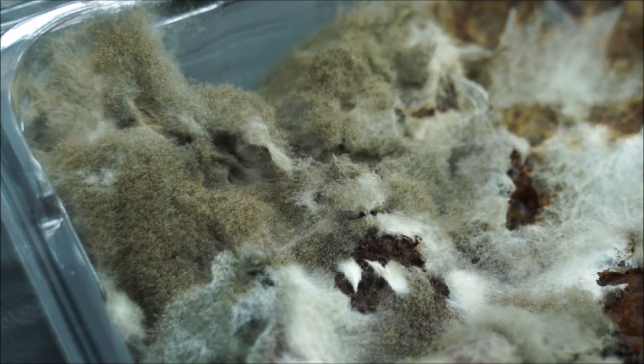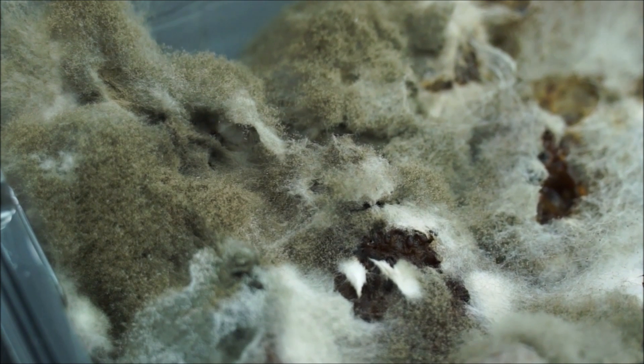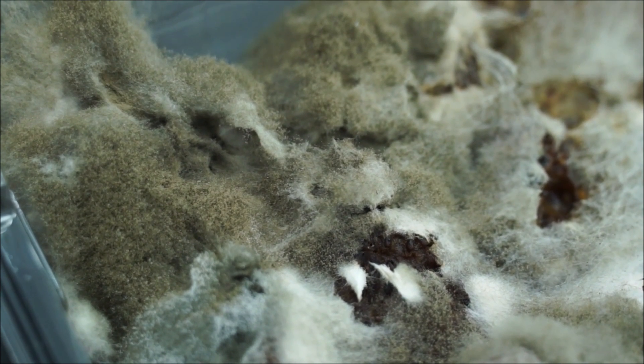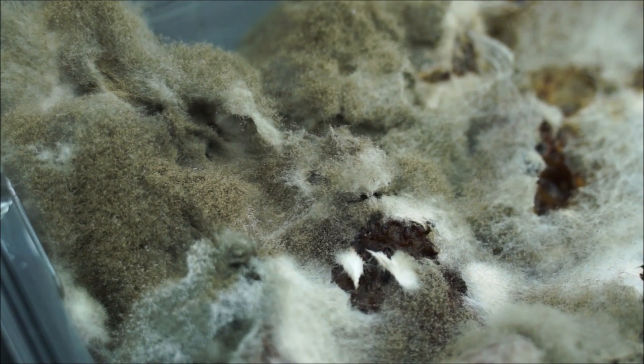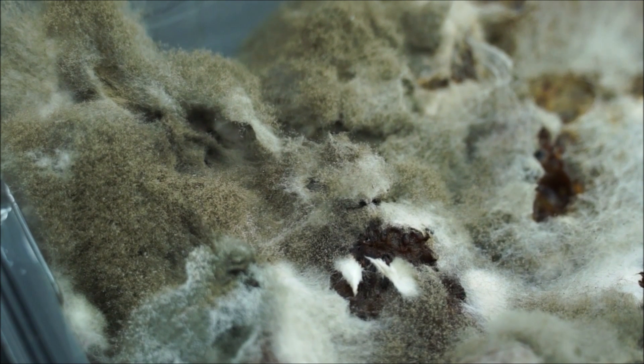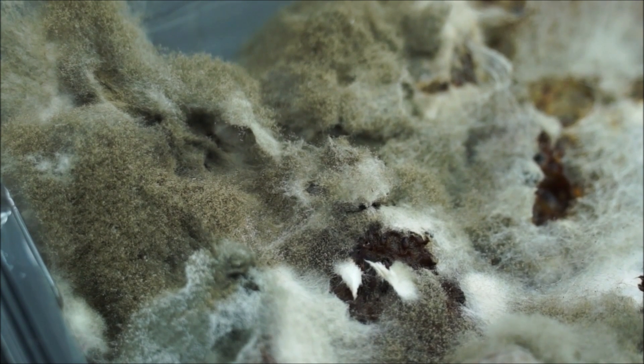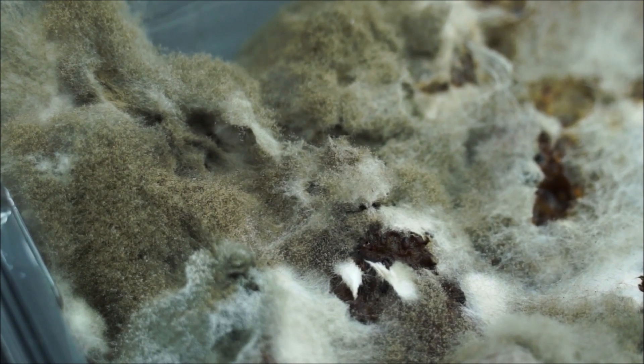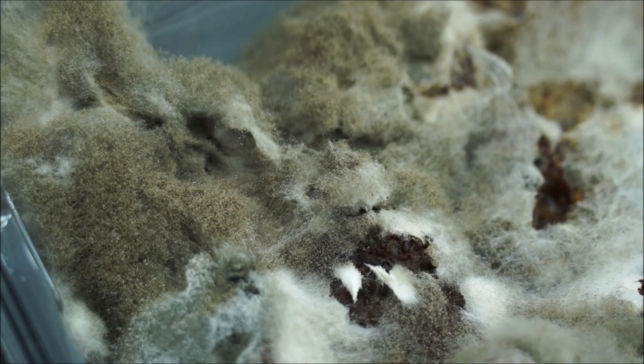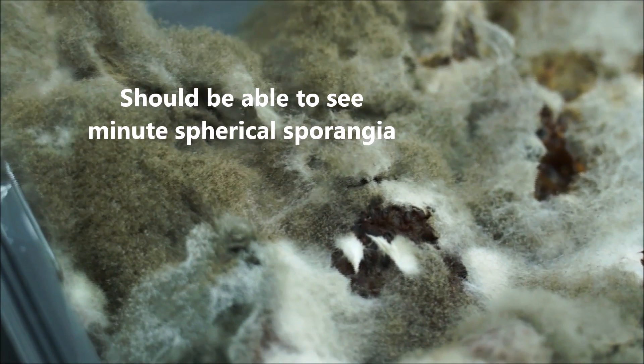And what you should do is actually get in and have a bit of a closer look, because what you want to see is not only the hyphae, so the anatomical parts of the fungus, but you also want to see the spore producing sporangia. And you can actually see them with the naked eye. So let's get nice and close.